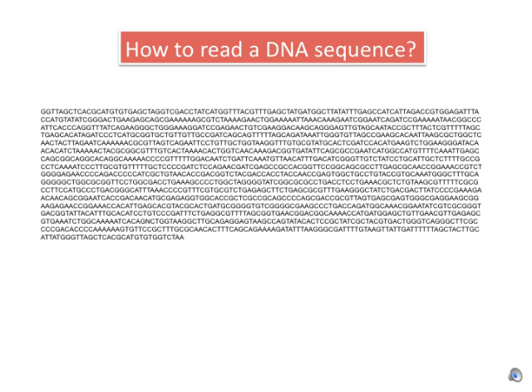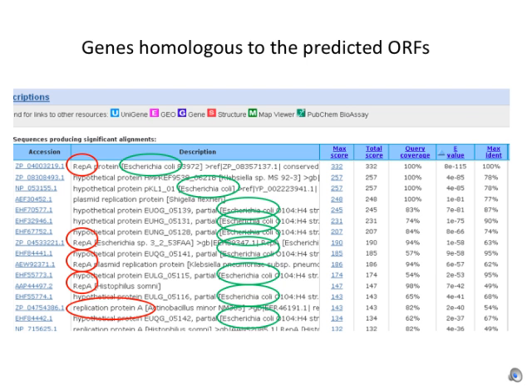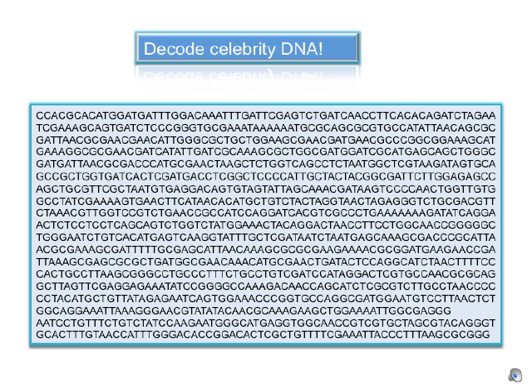We will read DNA sequences and learn to find probable genes in bacterial DNA fragments. It gets a little more complicated with eukaryotes.